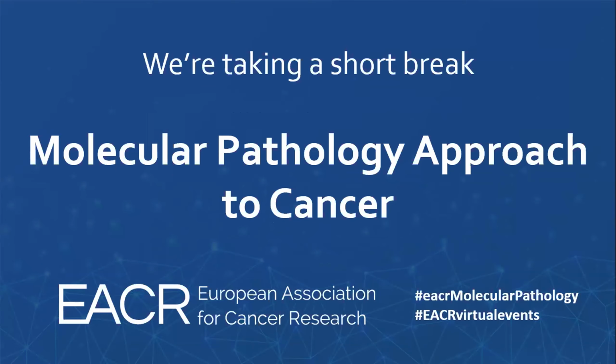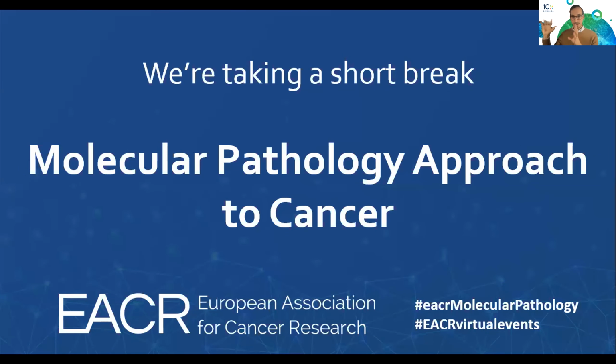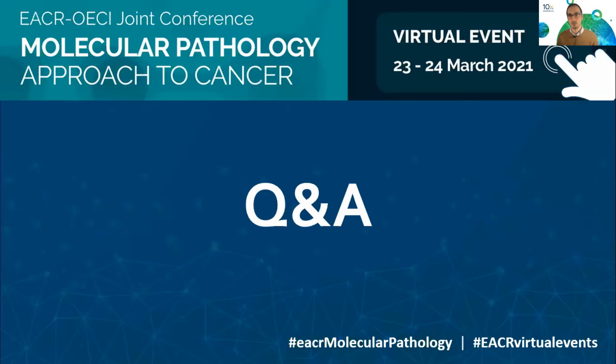Hi. I was just wondering, amazing technology. I was just wondering how you guard the patient safety of their data, just because you didn't go into it. Yeah. So what we offer is a research-only solution right now. So this is really more on the research side. What we provide is the kit, and then we provide the pipeline that has to be set up on a server, and then also the analysis software. So that's really up to the user to work with that.